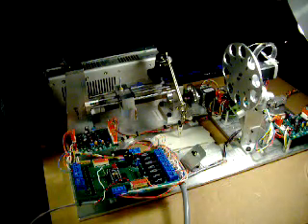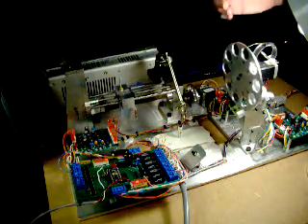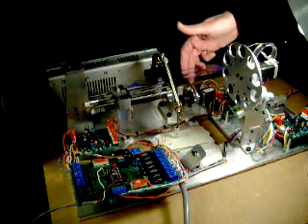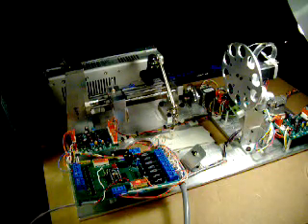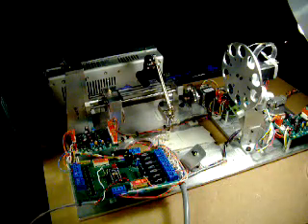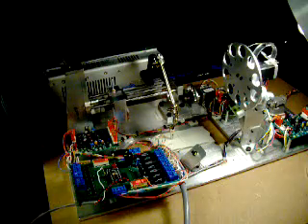The aperture wheel will reset to position 2. The lens wheel goes to neutral, and then the trombone goes to zero and comes back to the zero-zero position, which is indicated by the line on the paper.